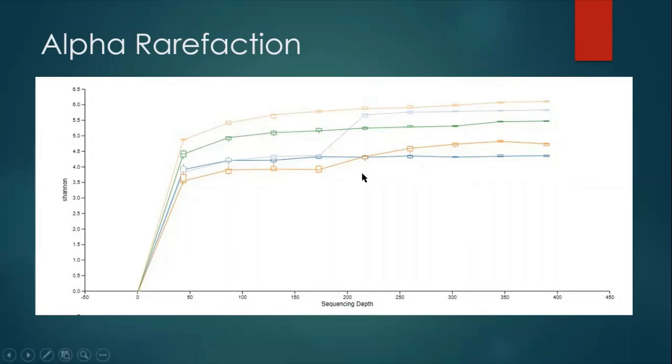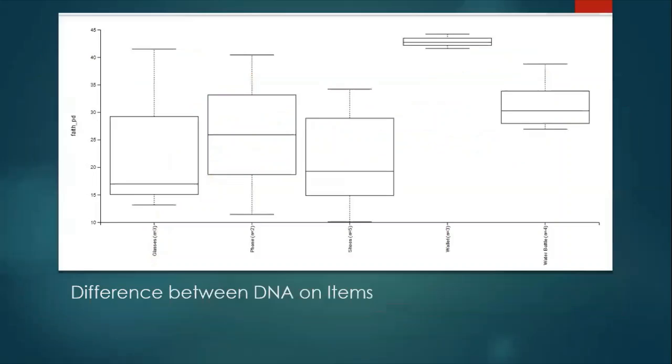So you can see here at a bit over 200 is roughly where it levels off. So that's good. It definitely means we've done the right thing. We have enough data. So let's keep going then.